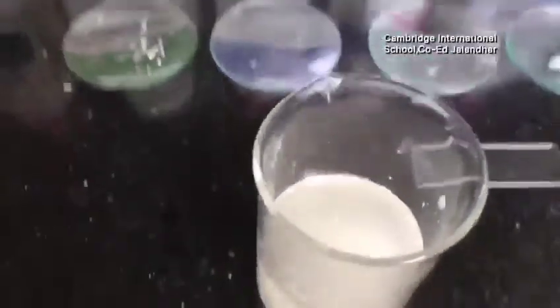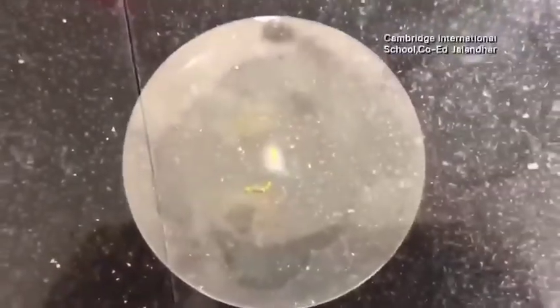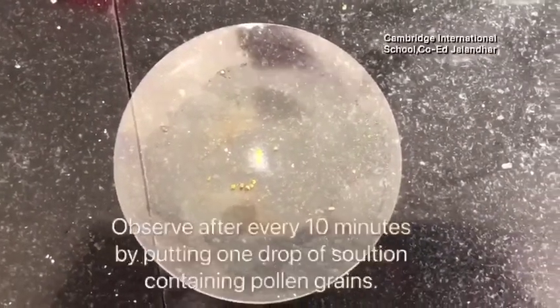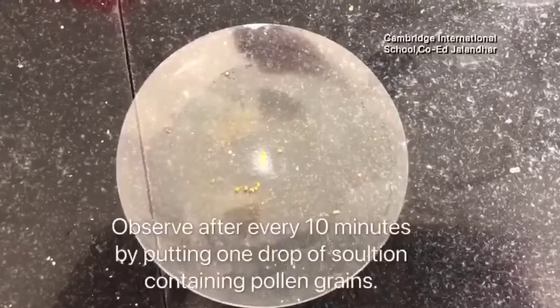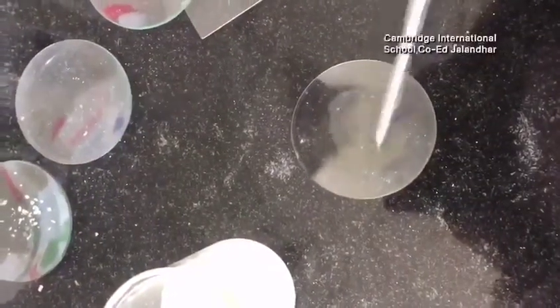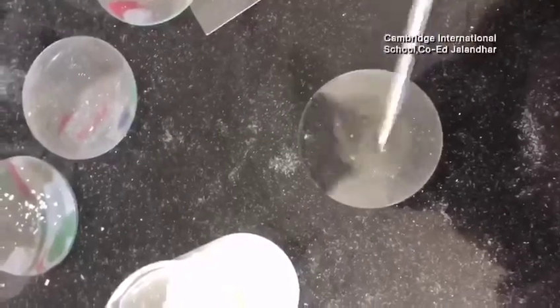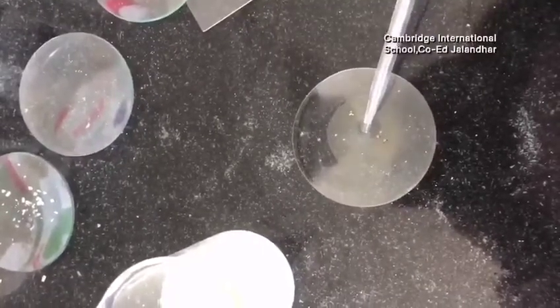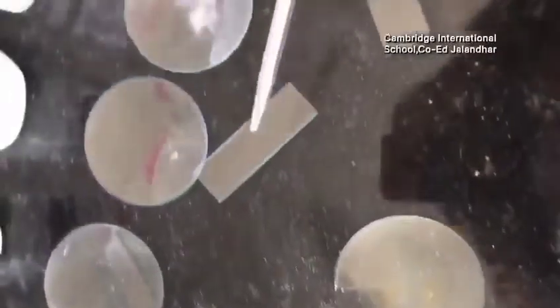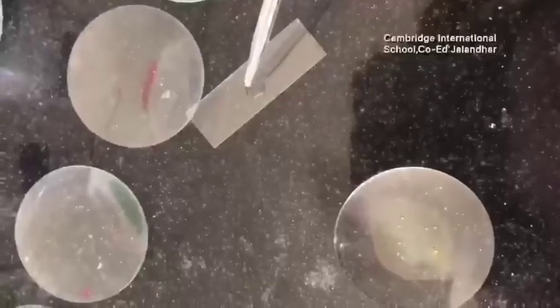The solution is ready. The observation will be taken after every 10 minutes. After every 10 minutes, we will be taking one drop from the solution that contains the pollen grains and we will place it on the slide.